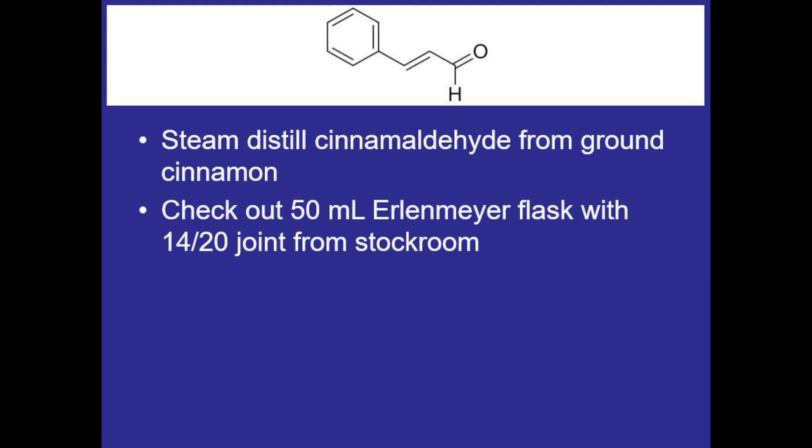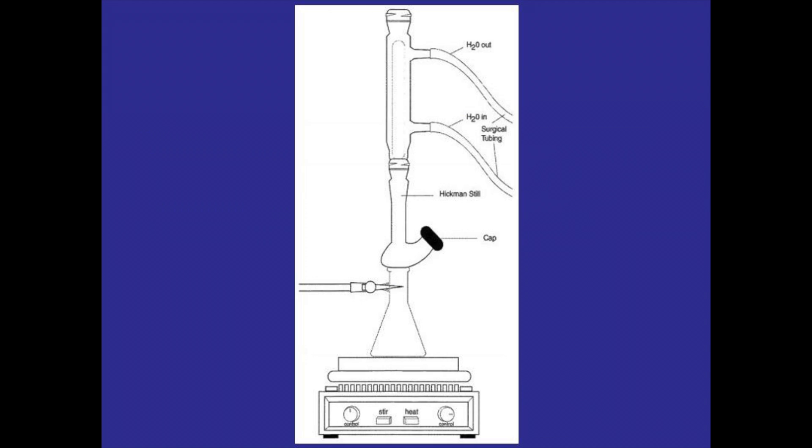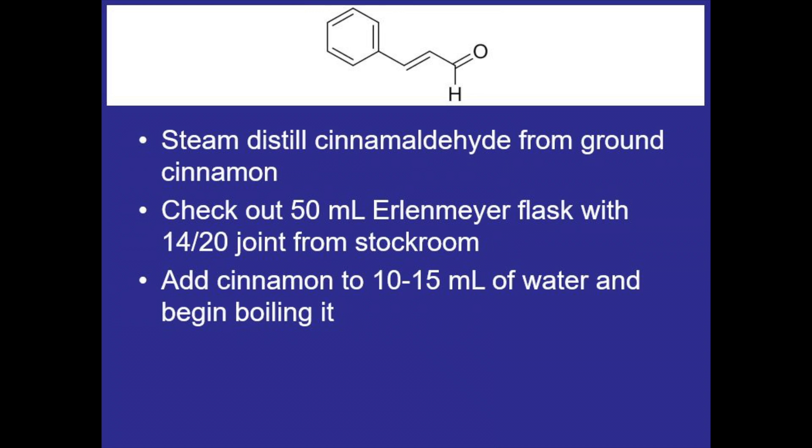In our experiment we will be checking out a 50 milliliter Erlenmeyer flask with a specific joint that can attach to the Hickman still from the stockroom. Then we'll add the ground cinnamon to about 10 to 15 milliliters of water and begin boiling it. We'll also be using Triton X-45 as a surfactant since it lowers the surface tension, helping the water boil not as violently so that we don't get cinnamon up into the Hickman still.